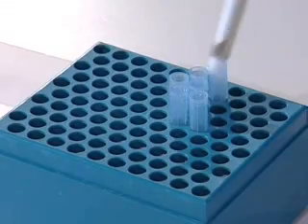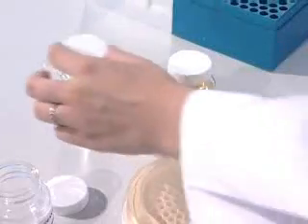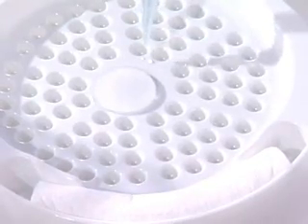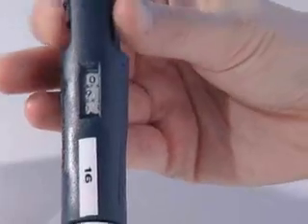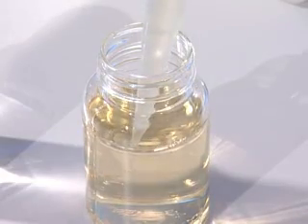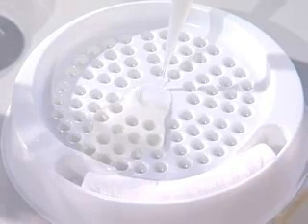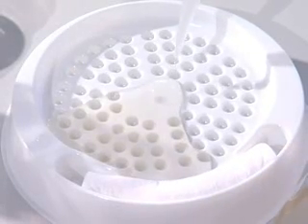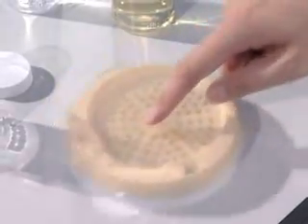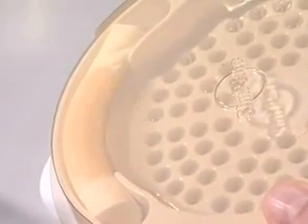Pipette 1ml of sample and then 9ml of rehydrated media onto the centre of the plate base. Cover the plate with the lid and gently swirl to distribute the sample into all the wells. Note that air bubbles in the wells do not interfere with the test. Tip the plate 90 to 120 degrees to drain excess sample into the absorbent pad.